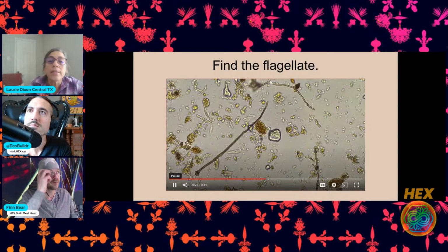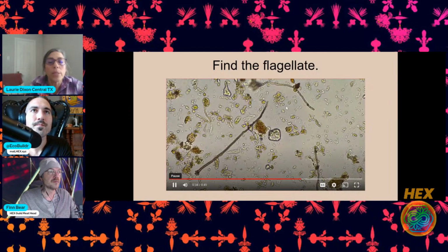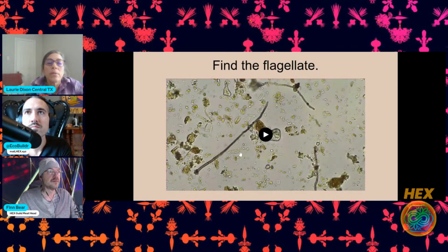You can see how this is lighter. When we're looking for fungi, we're looking for these squared off ends. If they're not squared off, usually it's going to be some kind of root material, and roots are also bigger. But yeah, you can see some movement here. That flagellate is probably under that aggregate. You can see these aggregates, more fungi here. This is just a beautiful sample.